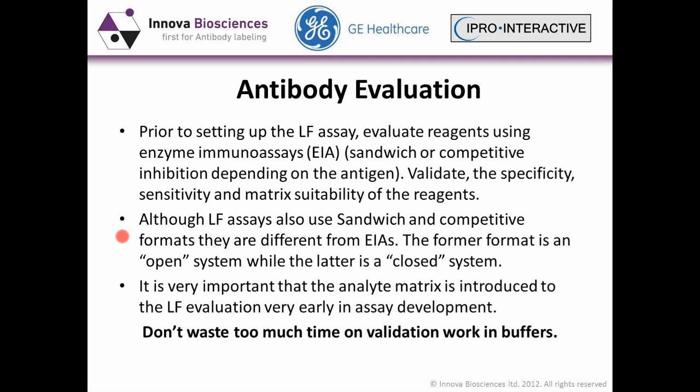And also, I think it's very important to move quickly into looking at your analyte and the matrix that the assay is designed for, and not to dwell too much on testing the analyte in buffers, because you could waste a lot of time doing that, and you find many problems when it comes to doing the lateral flow assay.